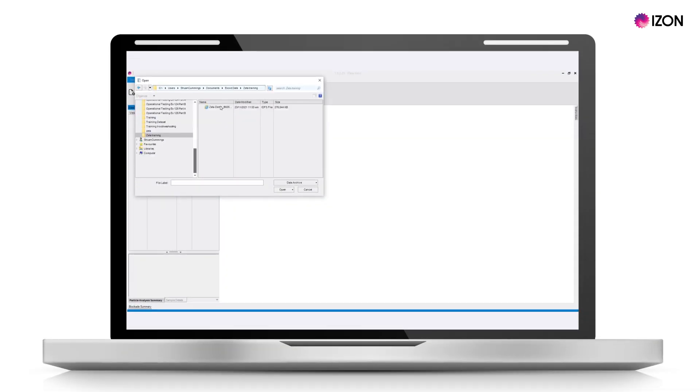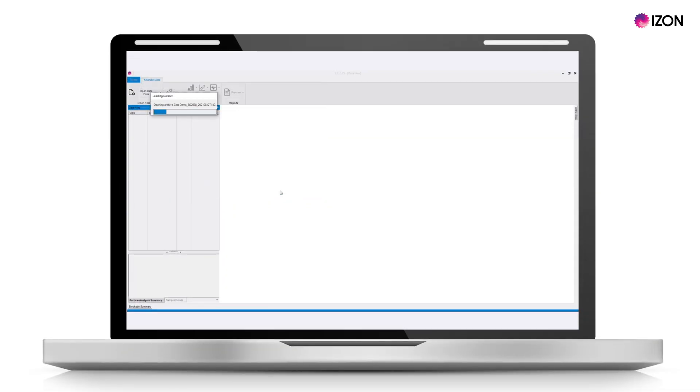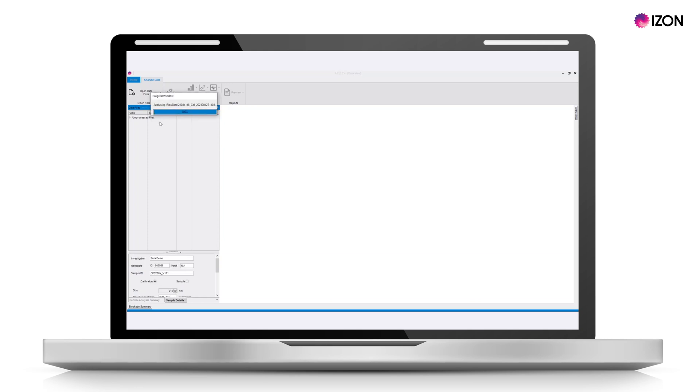Open your measurement file and right-click on unprocessed files, then select 'Process Files'. This might take several minutes for large data files.